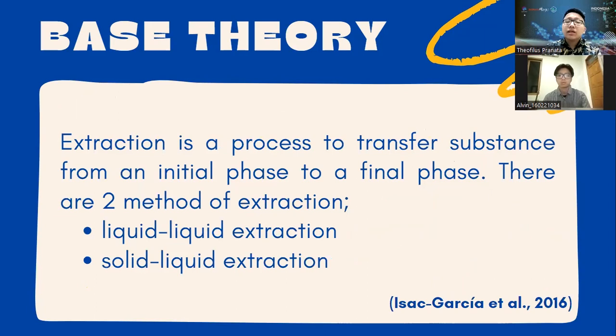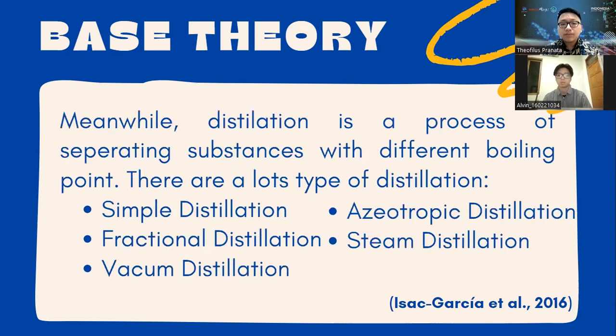Extraction is a process to transfer substance from an initial phase to final phase. There are two methods of extractions: solid-liquid extractions and liquid-liquid extractions. In this practicum, we use both of these. For the solid-liquid extraction is steam distillations, and the liquid-liquid extractions is at the separatory funnel.